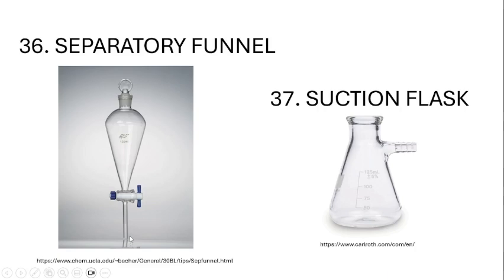So, what is the use of the separatory funnel? It is used for liquid-liquid extraction. You're going to separate the components of a mixture into immiscible solvent phases. You will be using this in the experiment later on involving separation of liquids at different phases.